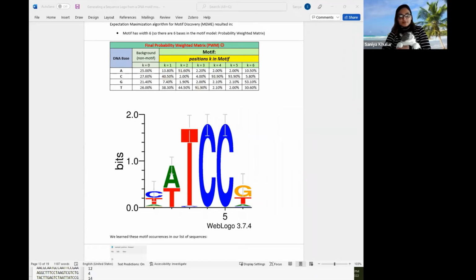Actually, how about I do it like the top two? So the top one is the C here. Let me find where else C was high, here and here. Then let me also look for where T was high. Its value was high, so T was high in the third position here.